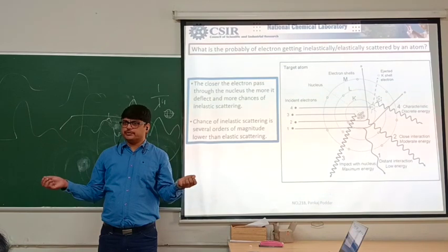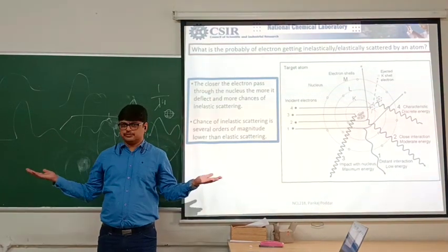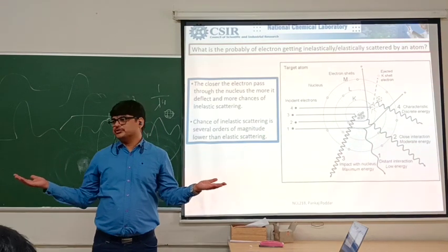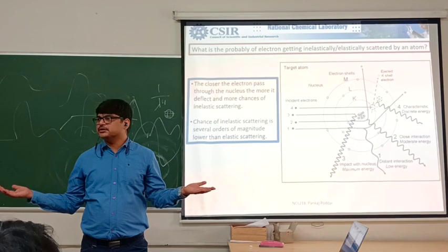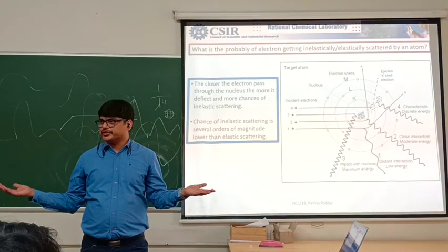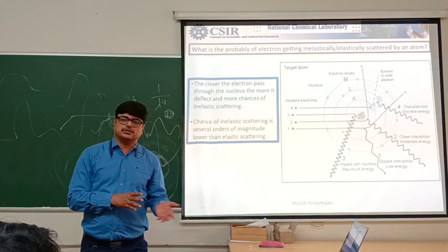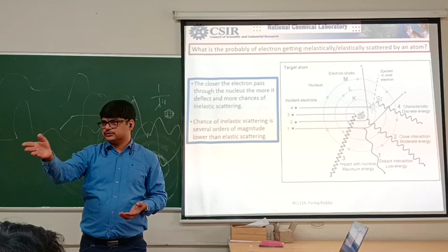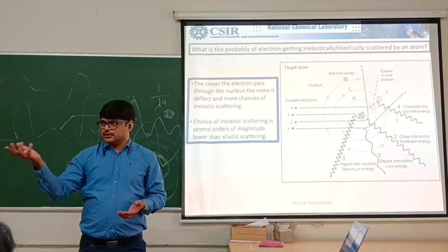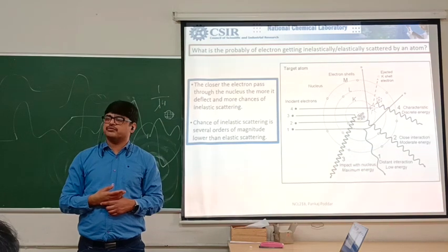So in metals, heat can also escape. Metals are good conductors of heat, not just charge, so metals can handle the heat accumulation in a better way. The problem is the non-conducting polymers and all these, your alumina, silica, all kinds of catalyst support will have a problem.